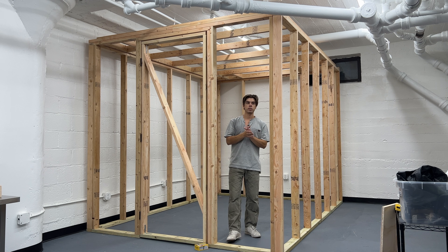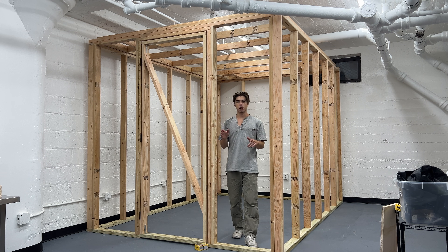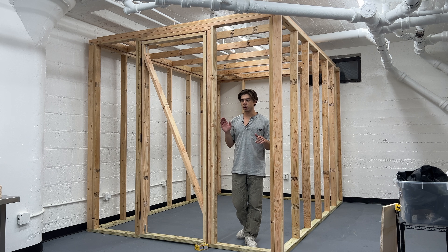I'm going to be using corrugated plastic sheets secured with screws and then flashing tape to seal it. Let's get started on that.